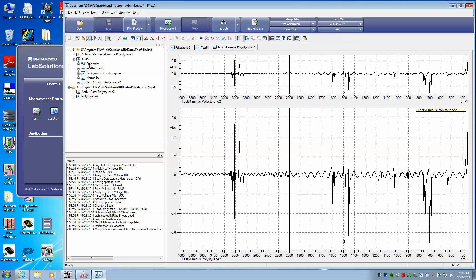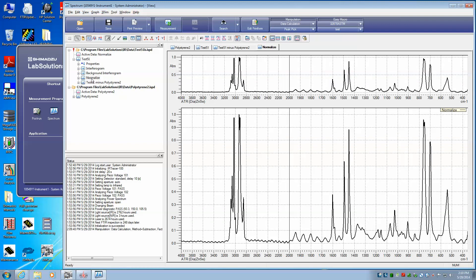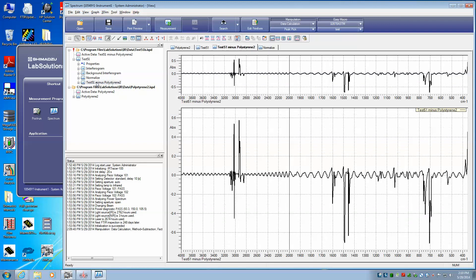So I have the original test 51, as well as the normalized test 51 that we did a few minutes ago, as well as now the difference file.